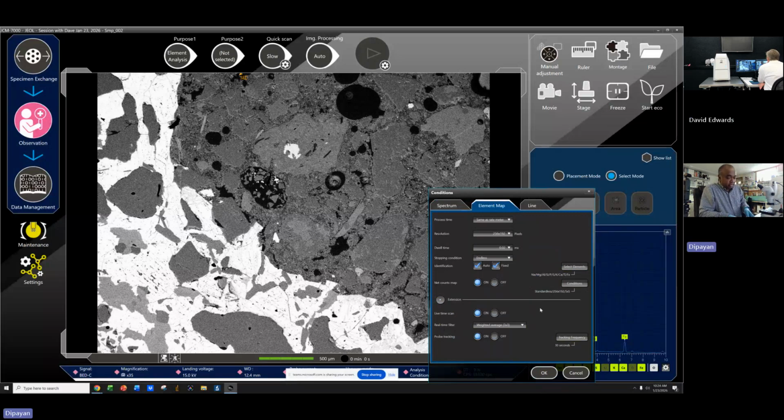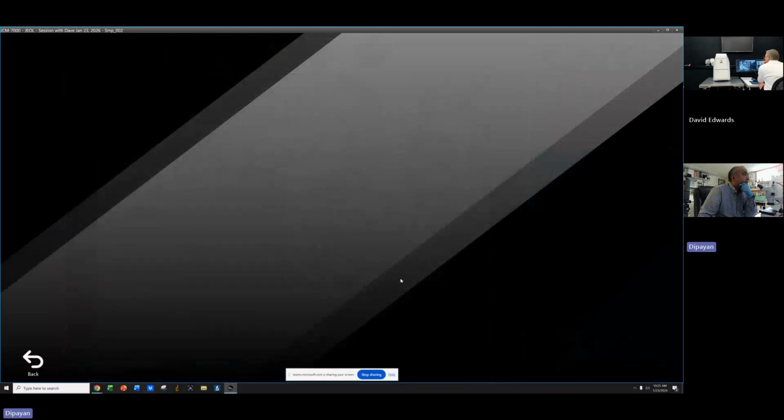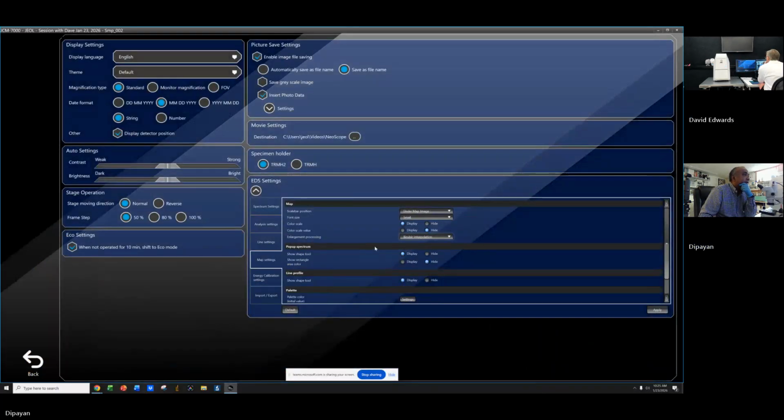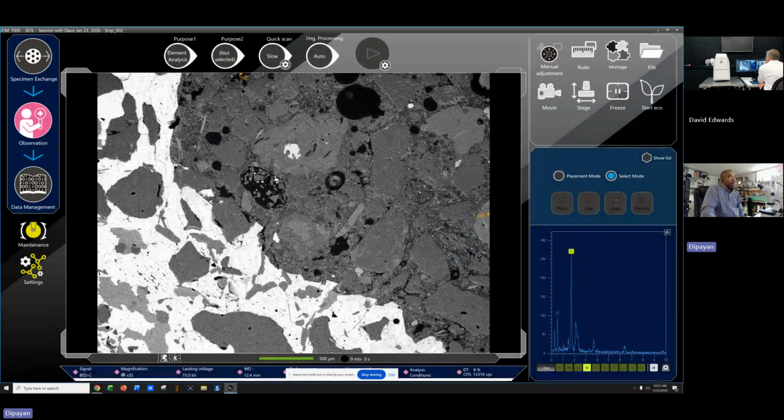Now, remember, all these changes we did in these condition sessions. Let's save it. Was there anything there we did? Not there. Okay, now there are so many places I can change those settings. That's why I want to know that I'm not messing up by changing at one place but not in the other place. So everything we did here.